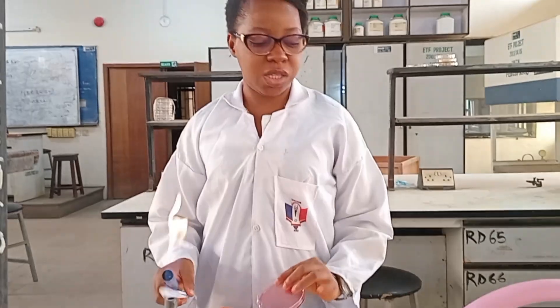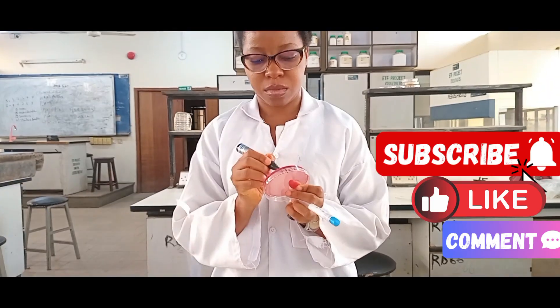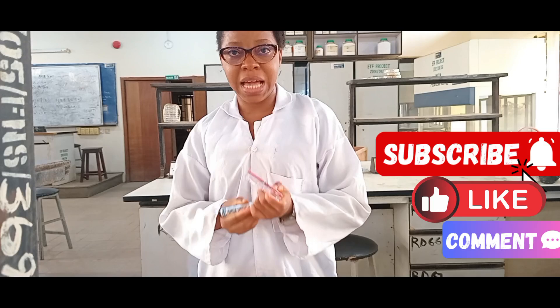I have lots of swab sticks here I'll be working with and I have different media: I have Cetrimide Agar, Mannitol Salt Agar, and I also have my CLED Agar. I have to make sure that my petri dishes are well labeled, because without labeling you could mistake one for another — some of them have the same color, so you just have to name them right.